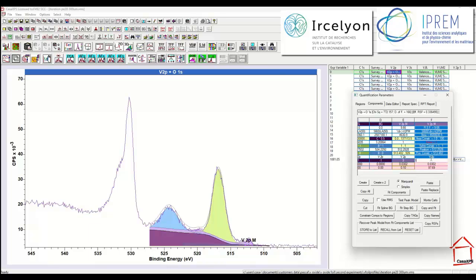I'll set that to a different component index for the background. I'll set it to a positive value this time. A negative value, -1, means that you can display photoemission peaks with non-negative values as photoemission peaks on top of background components that have the -1 as the component index. So I'm going to set this to 4 so we can see this as a different color, and you can see that I've overestimated by adding more intensity to the background signal than perhaps is warranted.